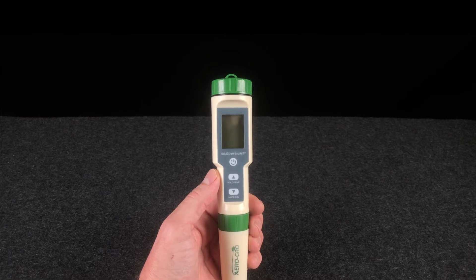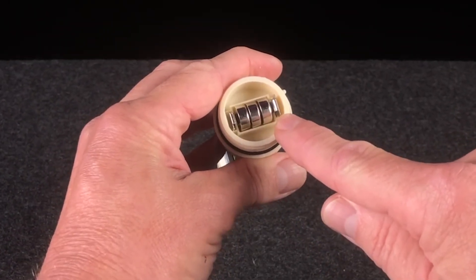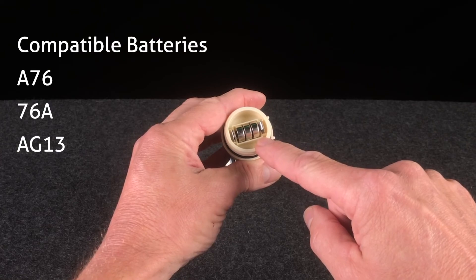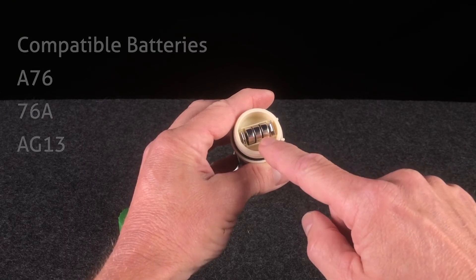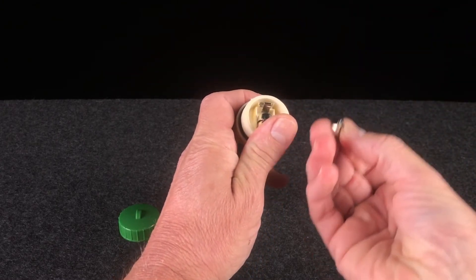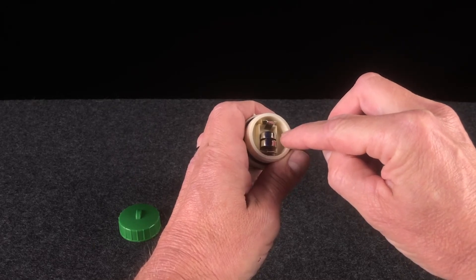Replacing the batteries in your 5-in-1 is quite simple. Simply remove the top cap, and you'll notice that inside there are three LR-44 batteries. These batteries are very easily found at local grocery stores and electronic stores, but if you don't find them locally, you can always find them on Amazon. Now the LR-44 batteries do go by quite a few other names, which I'm showing on screen here, so feel free to purchase any of those batteries — they will all fit your 5-in-1 meter. To remove them, simply use either your fingernail or a small screwdriver. Just pry them out gently and then replace. Pay attention to the polarity of the batteries, making sure they all go in one direction. Also, inside of the meter, you'll notice that there's a small plus sign and a small minus sign to tell you which way the batteries should go.